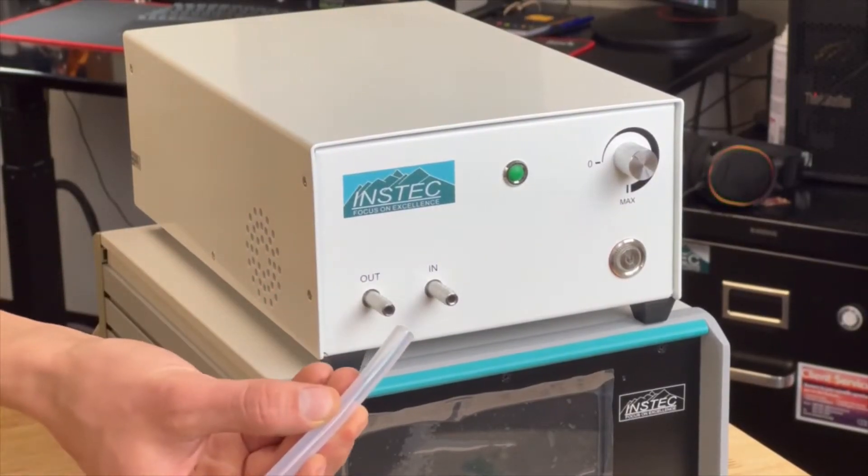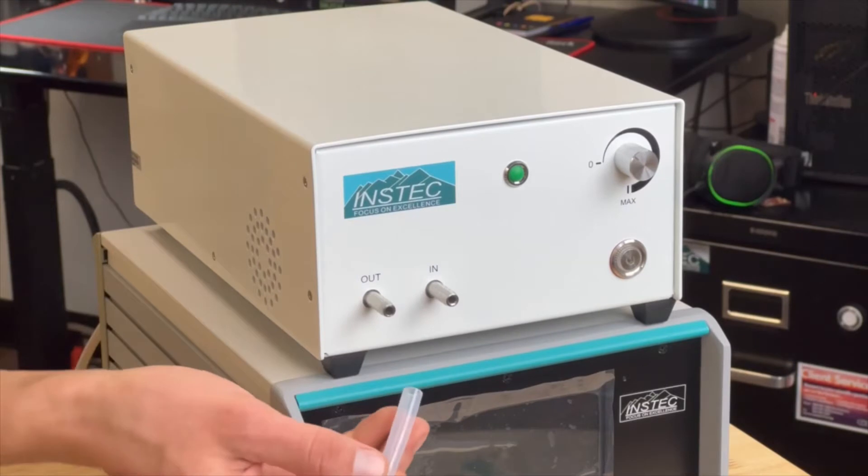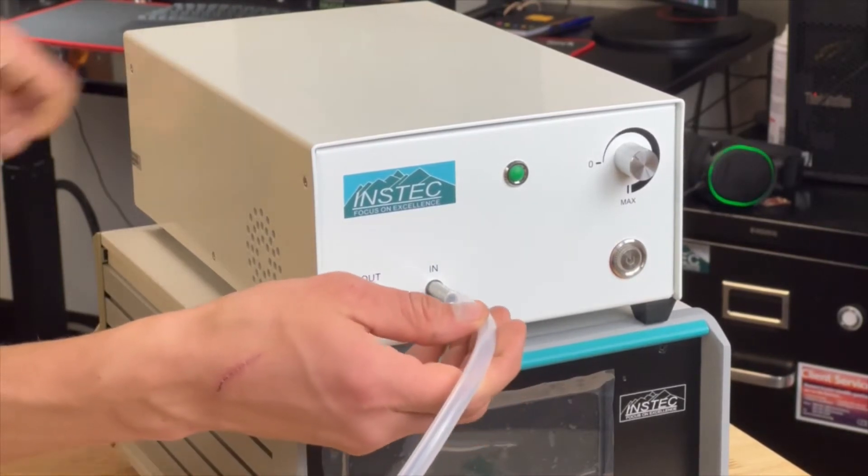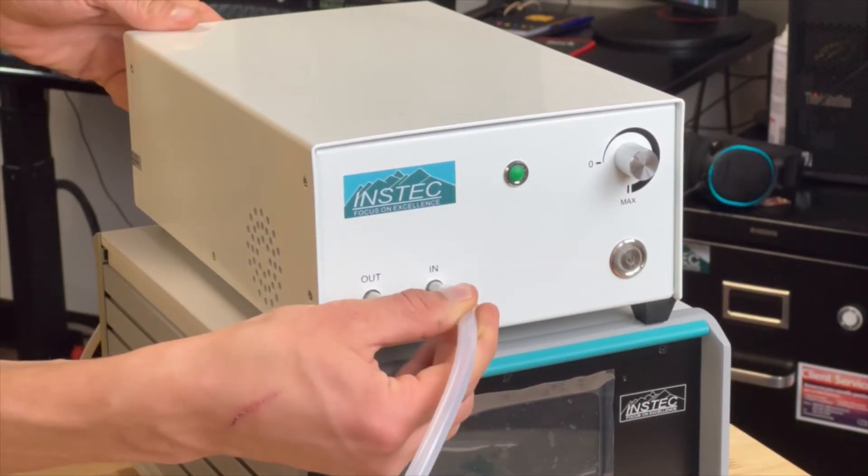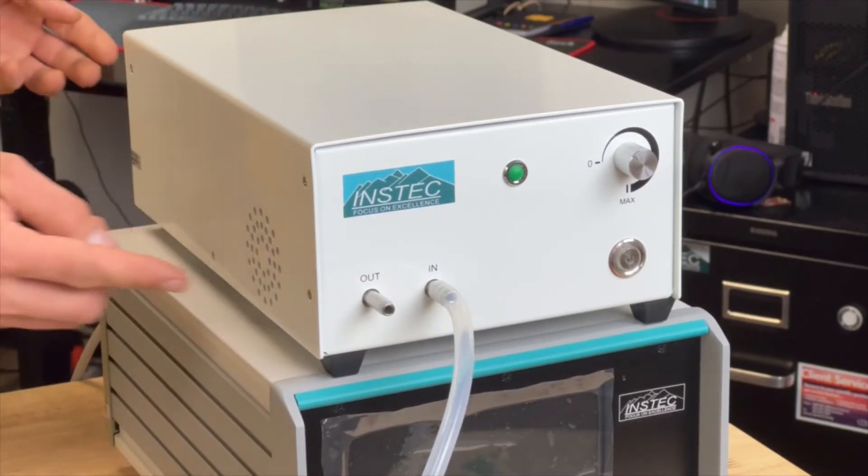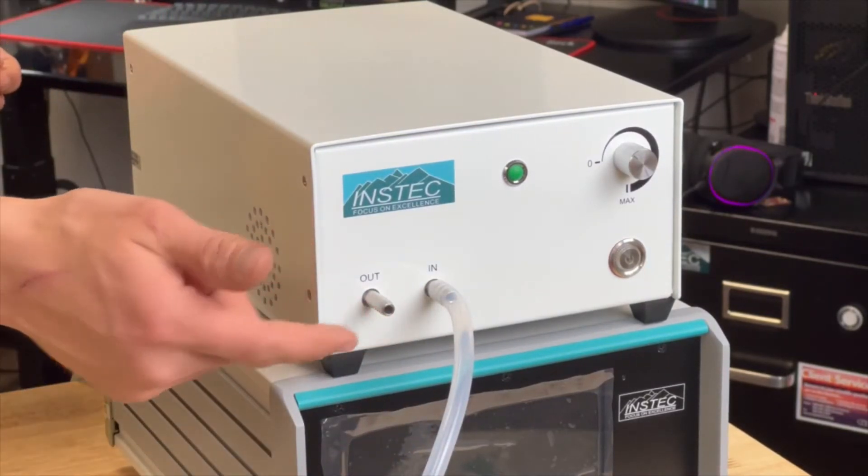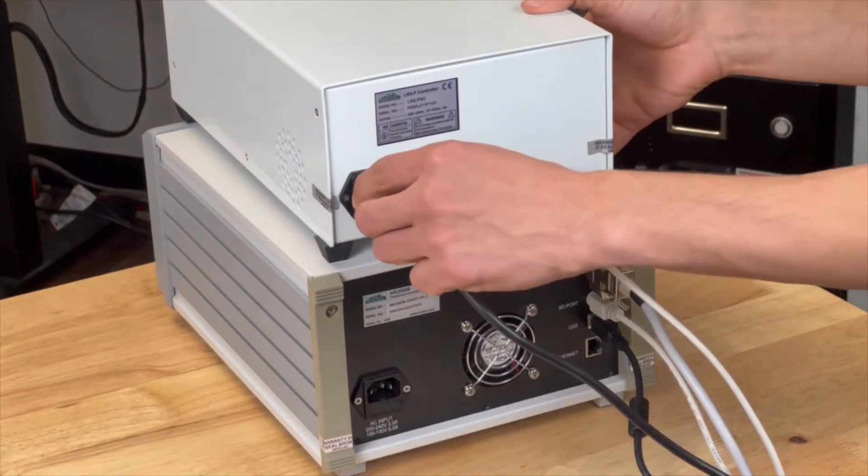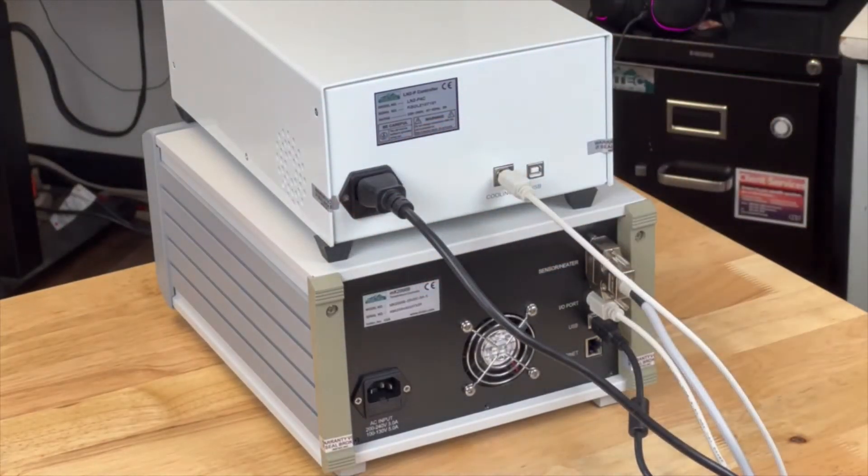Next connect the stage N2 gas outlet tubing to the suction pump inlet barbed connection. The suction pump pulls gas through the inlet. A heater then warms it before outputting exhaust as warm N2 air. Now connect the power cables for both the LN2 pump and temperature controller.